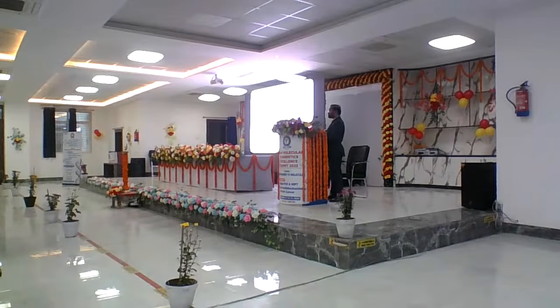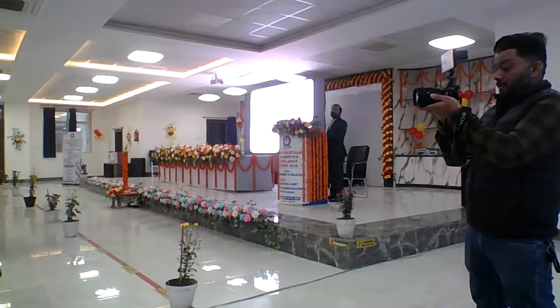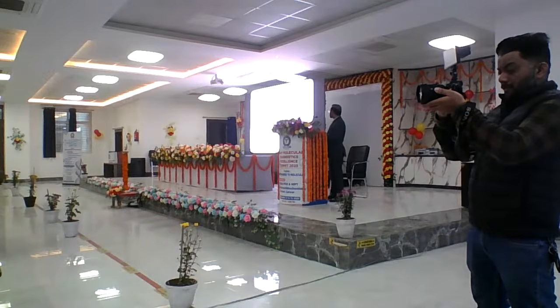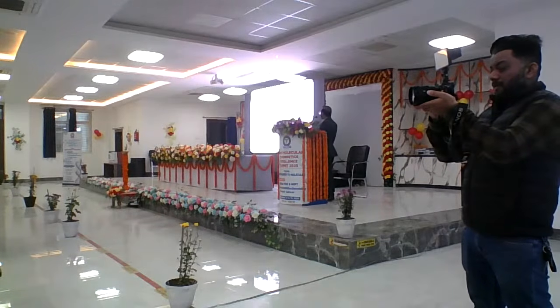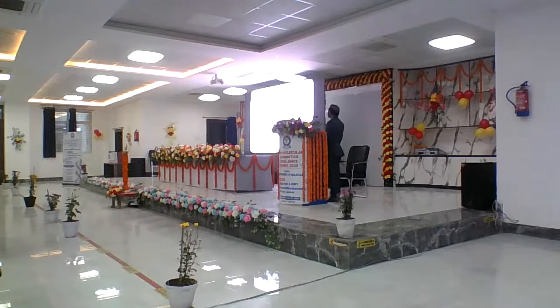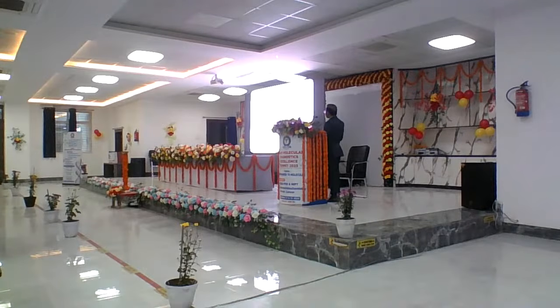Then you can use this for PCR amplification using digital PCR, and you can also count the number of positive events.